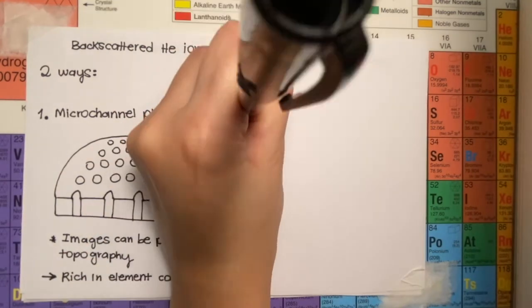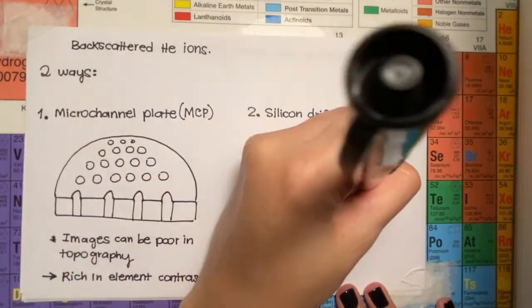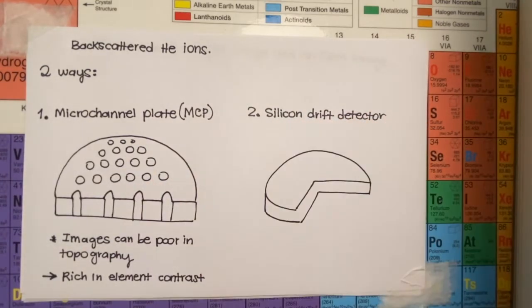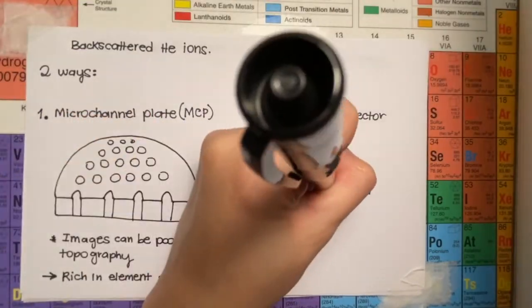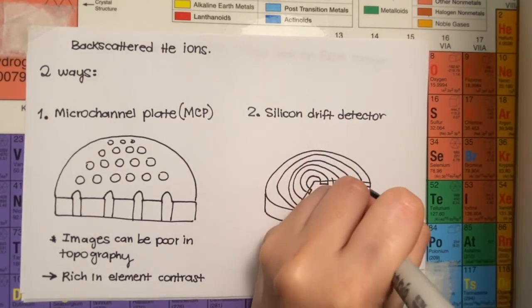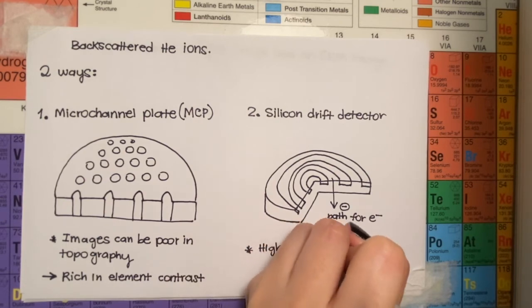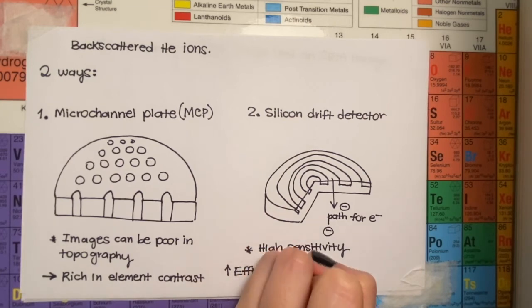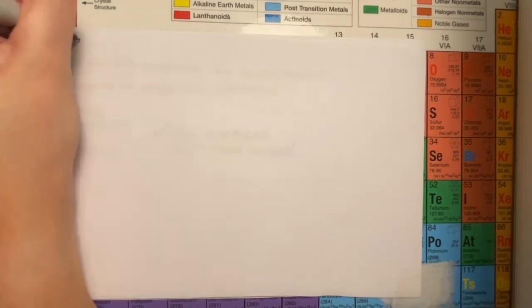The second one is a silicon drift detector that can be used to obtain spectroscopic information from microscopic areas. Quantitative element identification is possible in this case, with the same principles as Rutherford backscattering spectroscopy. It is important to consider that high sensitivity is needed from the detector. The backscatter efficiency can be increased by lowering the acceleration voltage, but this will reduce the sampling depth.